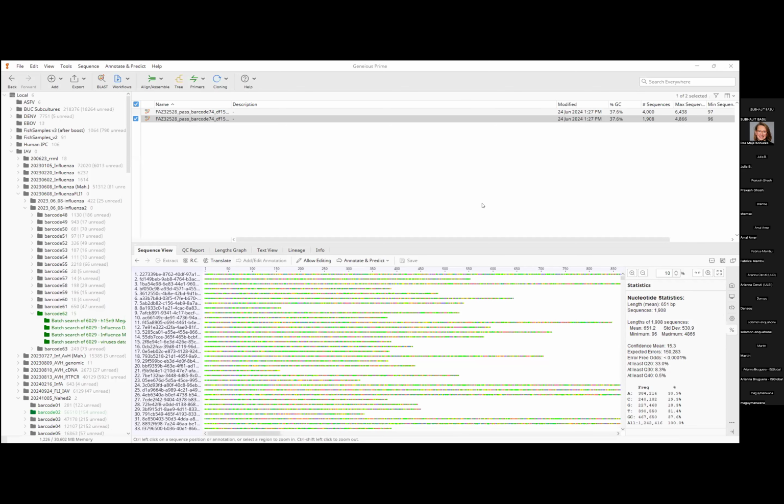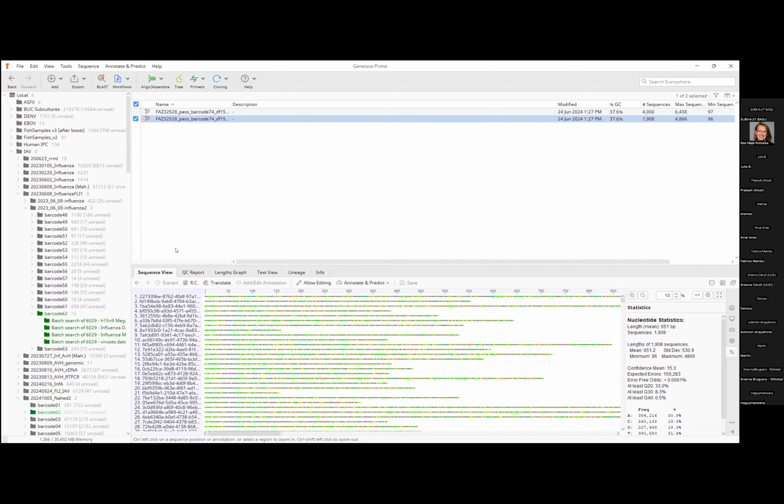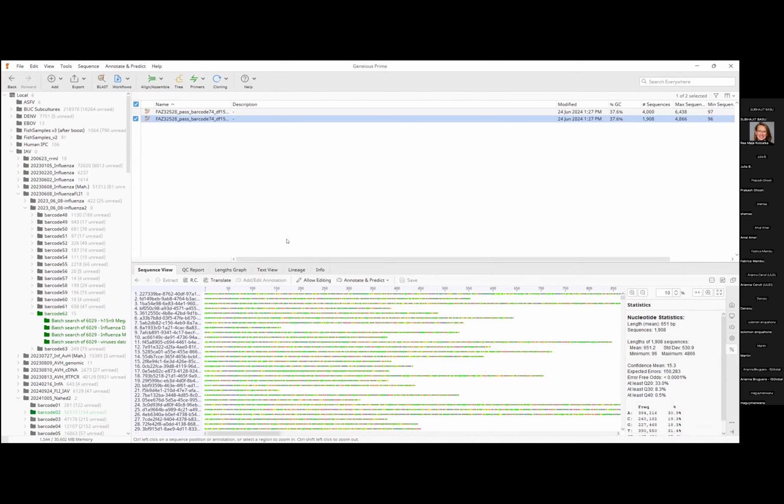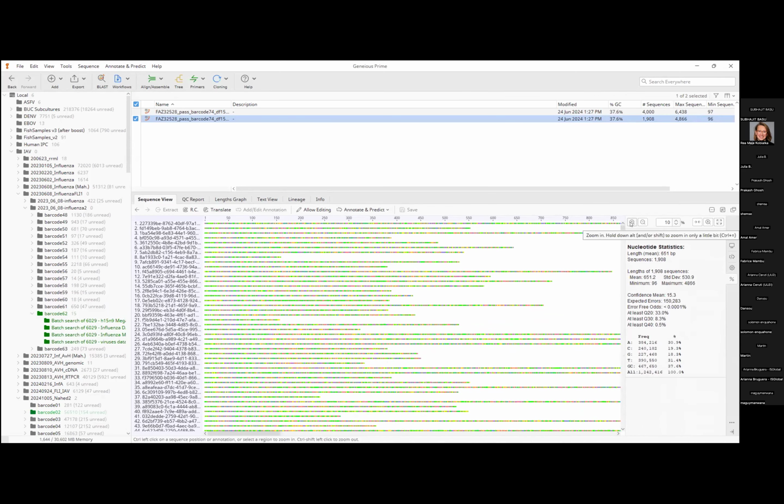All right. So the first time I opened this, I was a little intimidated by the whole thing, but it's actually really simple. It's really intuitive. On the left side, you have your folders. Yeah, just like on your laptop, the same thing. On the upper side, you have your working field, where you can click whatever you want to work on. And on the lower bottom side, you have the visualization of whatever you're clicking on. So you have these 3 fields that allow you to do whatever you want to do.